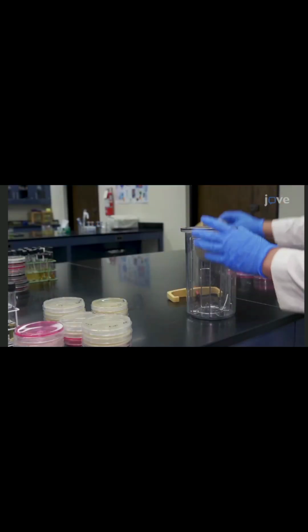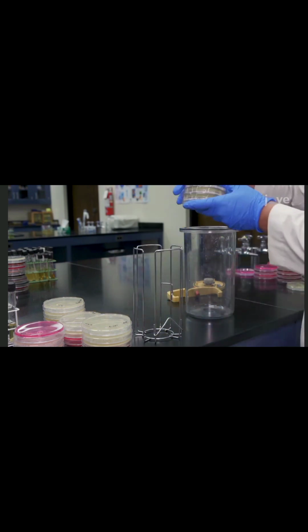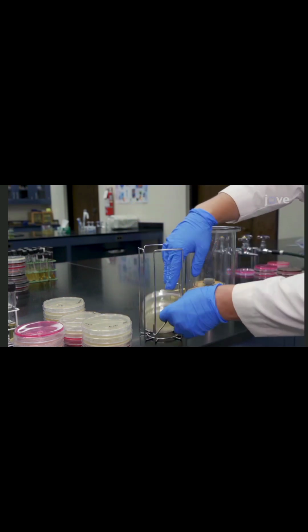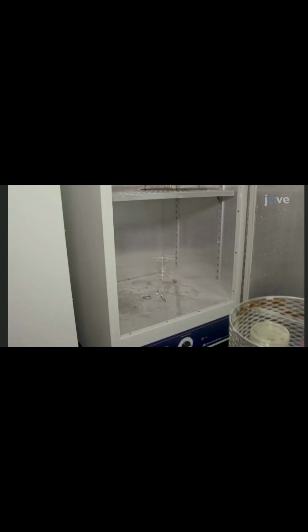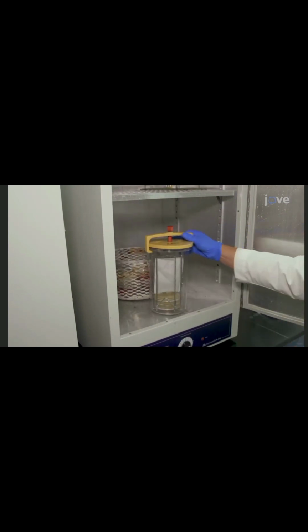To determine which organisms can grow in a reduced oxygen environment, open up a sealed gas chamber system and place 1 set of 4 TSA bacteria plates inside. Then place an anaerobic conditioned sachet into the chamber and seal it tightly. Finally, place all of the plates, including those inside the sealed gas chamber system, into a 37°C incubator overnight.